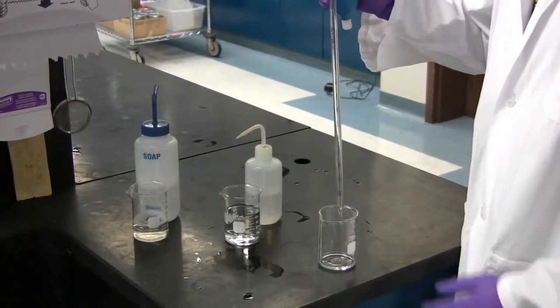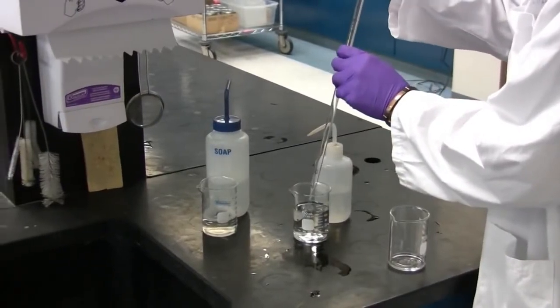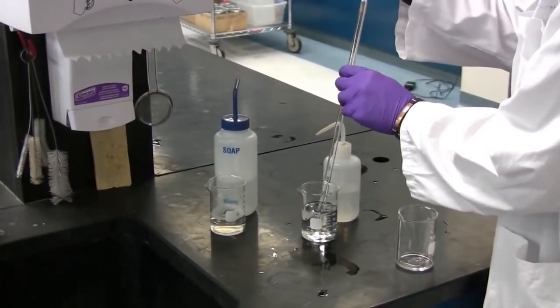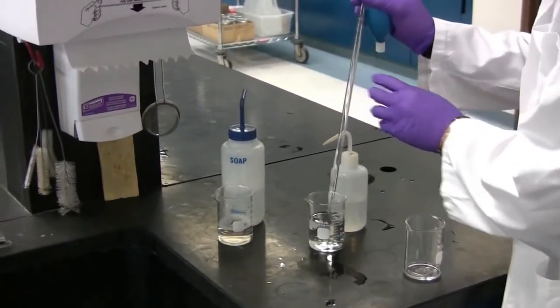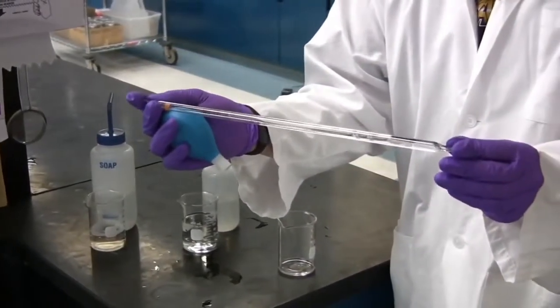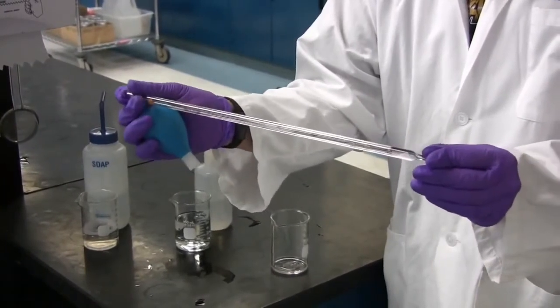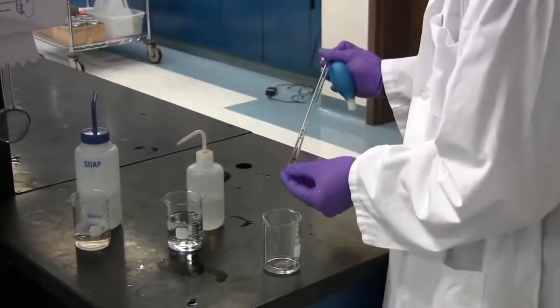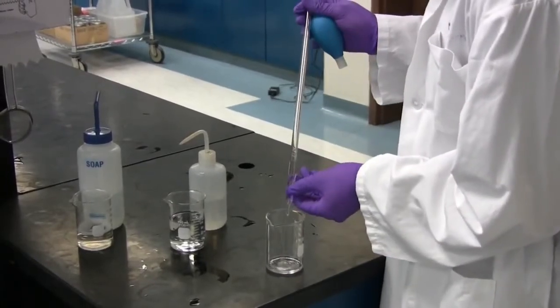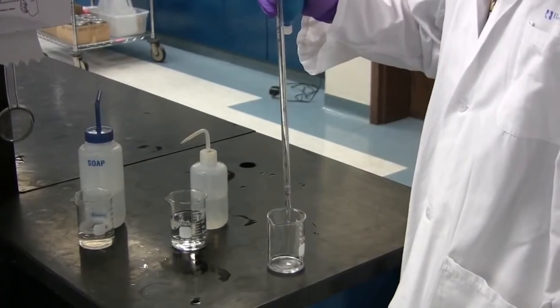Once finished, you need to start by withdrawing some tap water inside of it and repeating the exact same procedure. Tilt it back and forth to ensure coating the pipette and rotate it towards yourself to coat all sides without spilling any liquid. This will be deposited into the exact same waste beaker. Repeat this procedure 6 to 7 times.